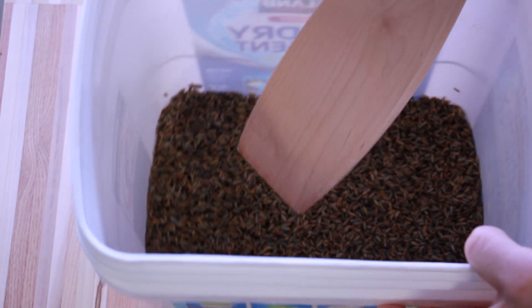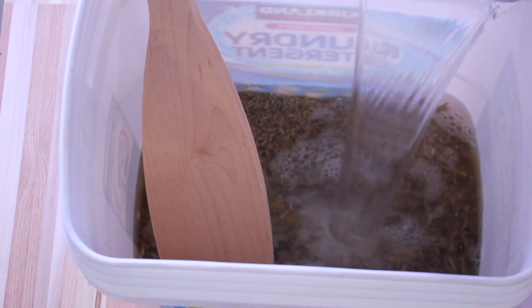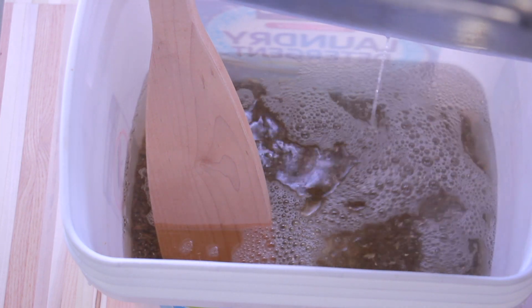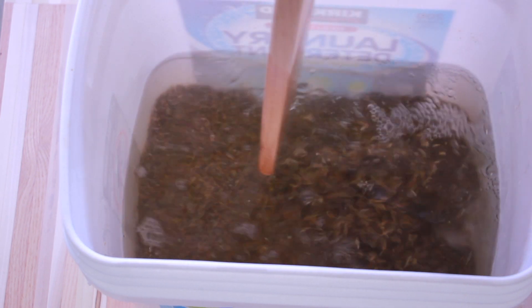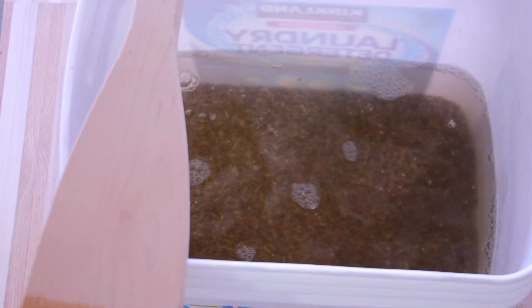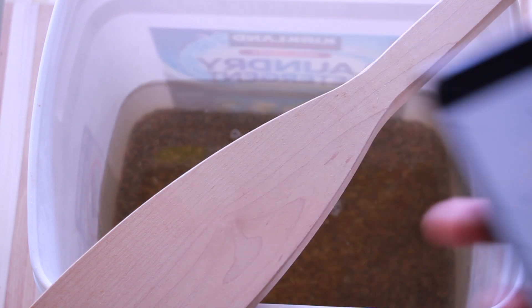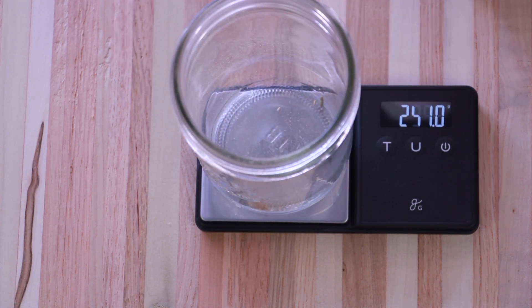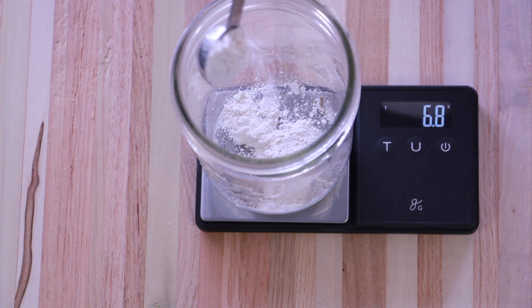Pour the hot water into your rye grain bucket and give it a little mix. I'm adding 2% gypsum powder, so 2% of the total grain weight that I used is 14.4 grams. This is where I use my 10th gram scale — it comes in really handy here. Make sure you tare it out for your container and then add your gypsum powder to the scale to the desired weight.